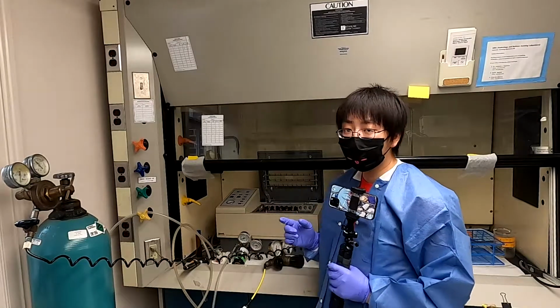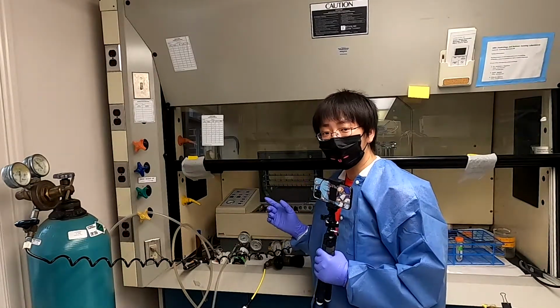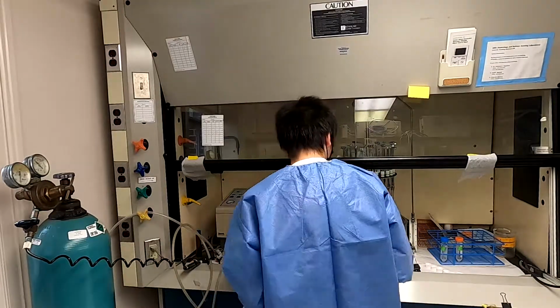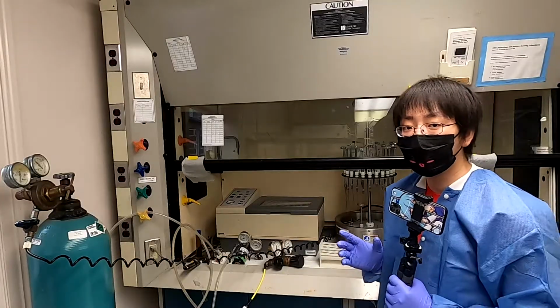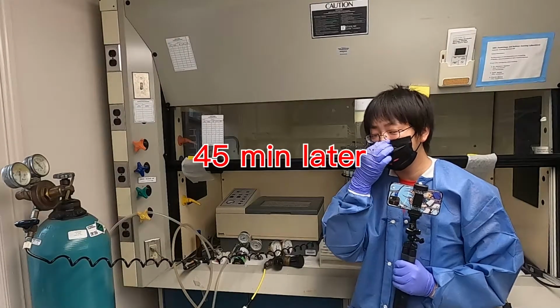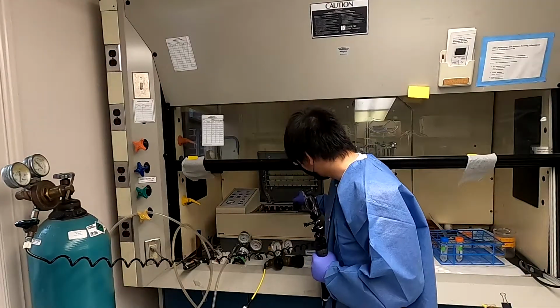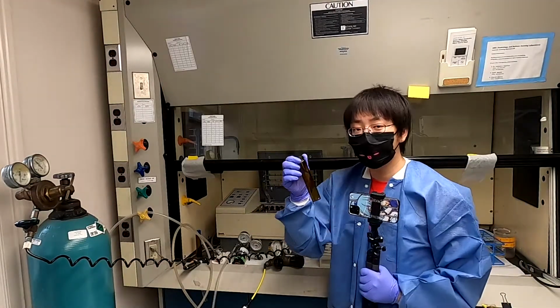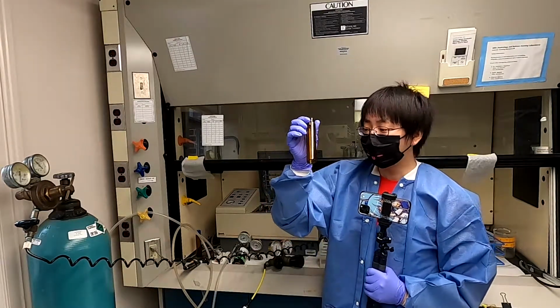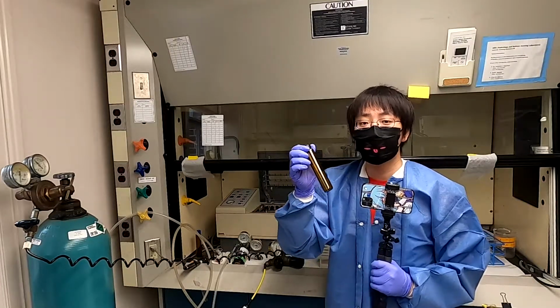It will take about 45 minutes to dry out this solvent. And so let's wait for about 45 minutes. And so now it is after 45 minutes, and we can see that this is completely dry. And we have some crystals at the bottom of this vial, and they contain the DDT.